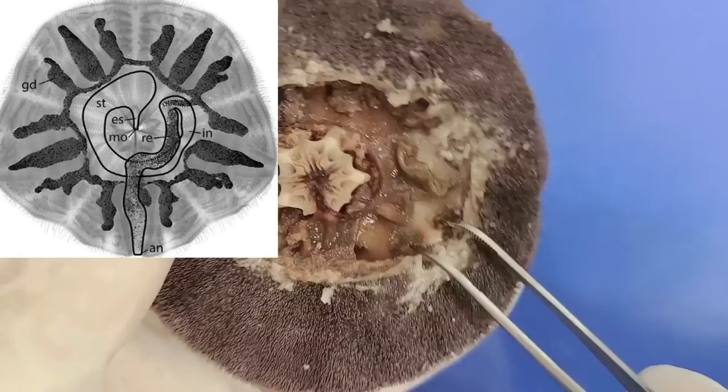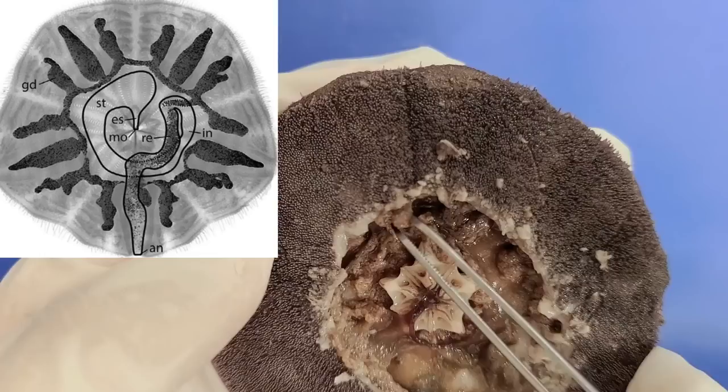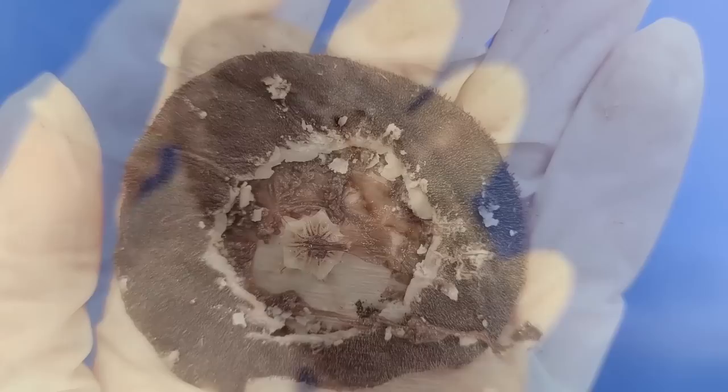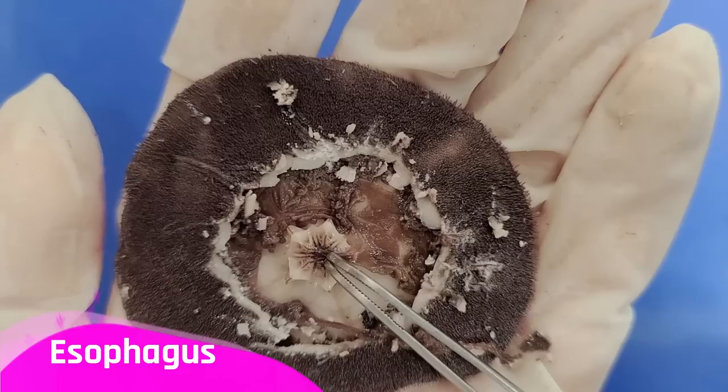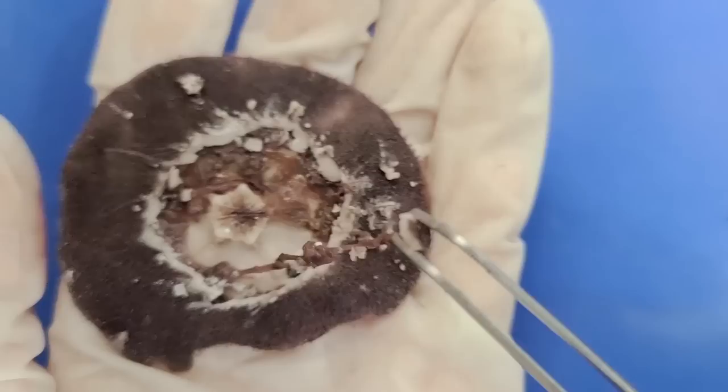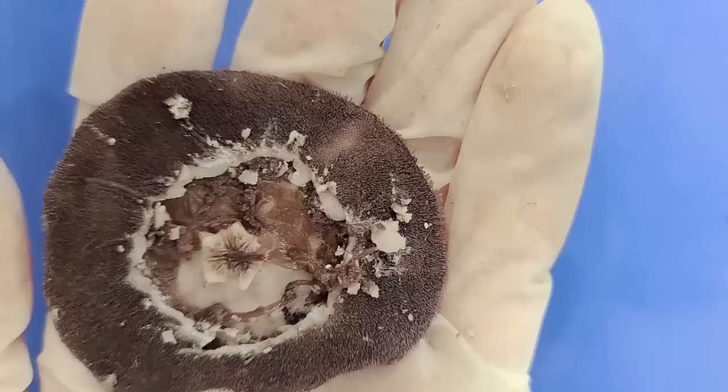The stomach then leads into the intestines, but you can't really see them here. The intestines then lead into the rectum, and then the anus, which would be somewhere on the side as we saw before. Here's another sand dollar I dissected where you can see the intestines a little better. Here's the esophagus, which leads into this white pouch-like structure — the stomach — and then the stomach leads into this thinner intestine, which then leads out into the rectum and the anus.